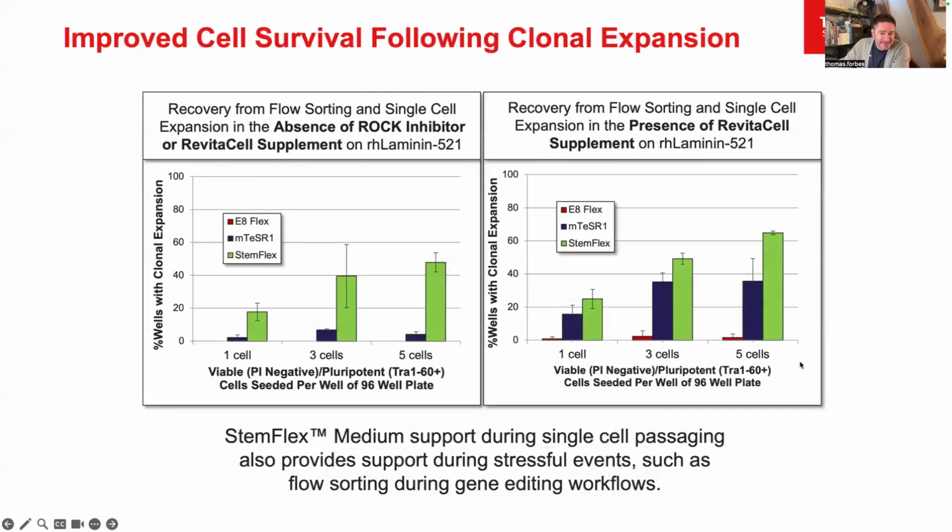Again, this is a bit of data here that I think Omar may have showed before, but it's comparing recovery in different media systems, basically just showing us that, again, media is an important consideration for these challenging workflows. And at the end of the day, you can save a lot of time and money and frustration by picking the right culture system for a particular application.